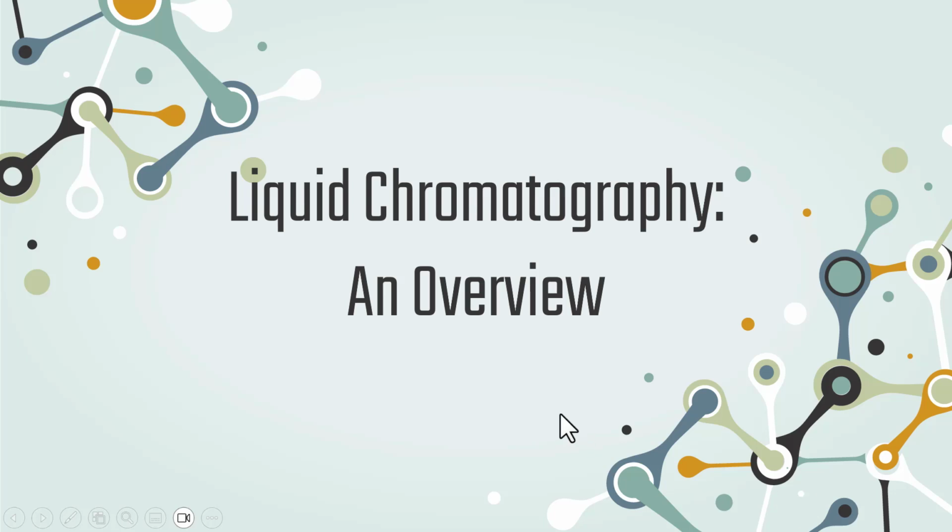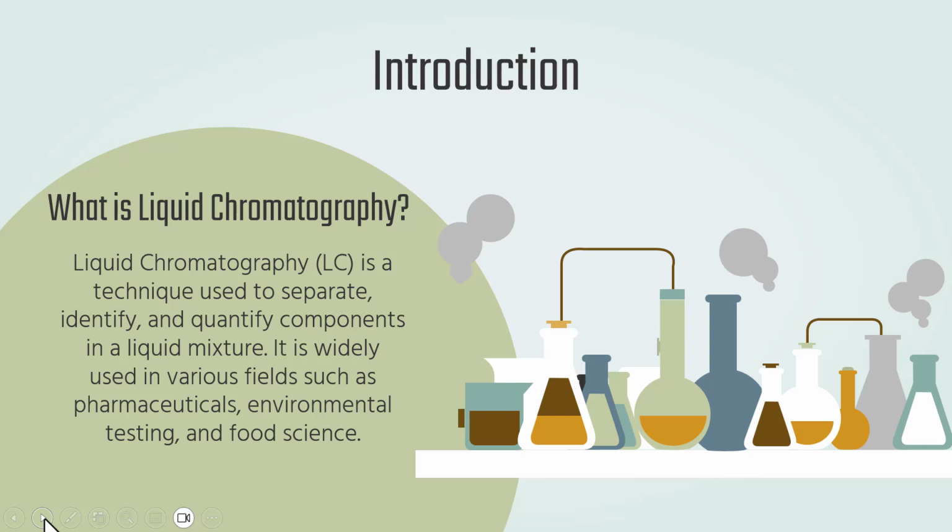Today we are going to dive into the fascinating world of liquid chromatography. This technique is essential for separating, identifying, and quantifying components in a liquid mixture. Whether you are a student, researcher, or just curious about how scientists analyze mixtures, this video is for you. Let's get started. What is liquid chromatography?